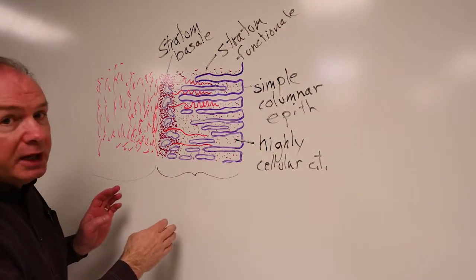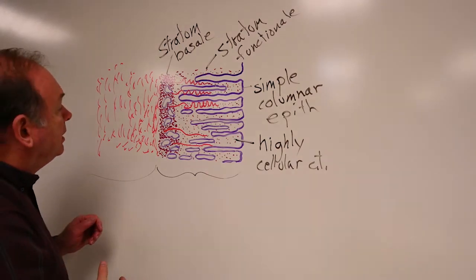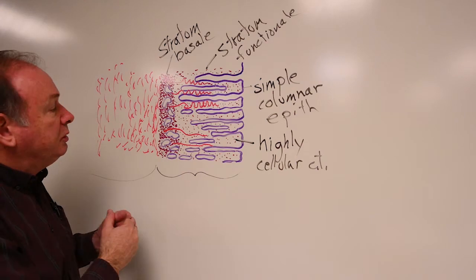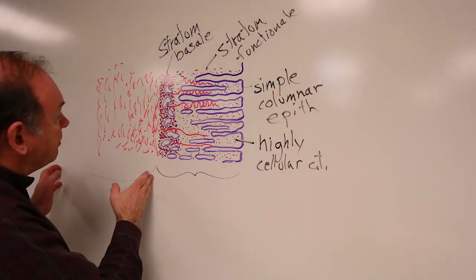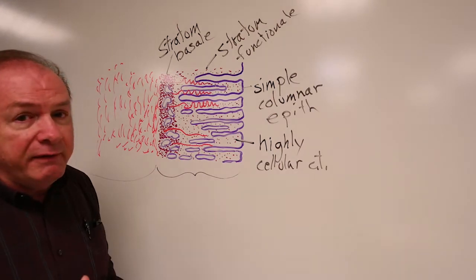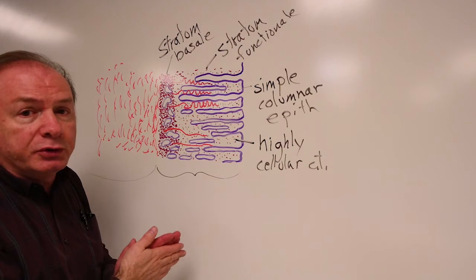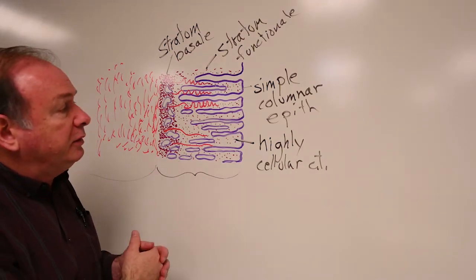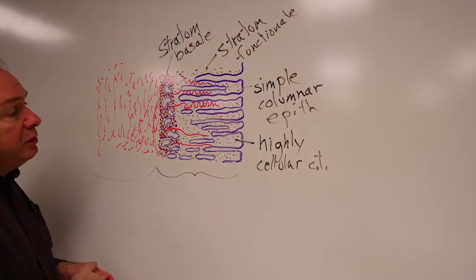Underneath of that, like we said, smooth muscle, a very thick layer of smooth muscle. It goes every which direction, and it's mixed with a lot of connective tissue. It has a good blood supply there as well. So anyway, you have a thick muscular zone, and then a very, very thin, what we call perimetrium. It's just a thin serosal membrane on the very outside. It does have a mesothelial covering, so it is a true serosa on the outside of the uterus.